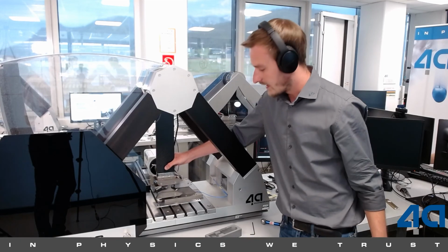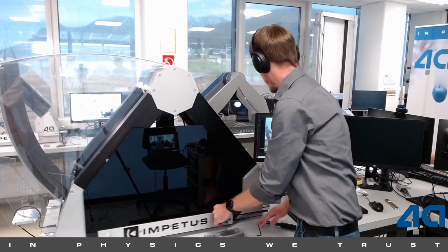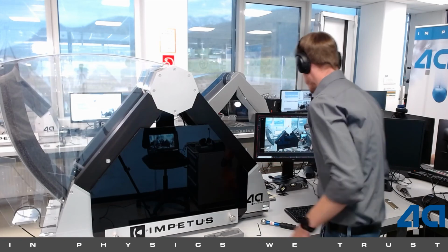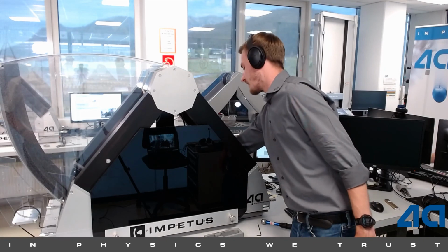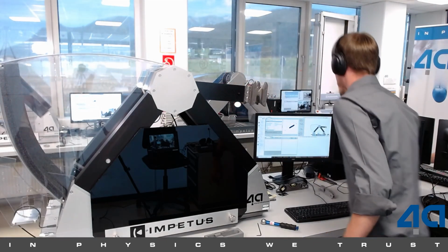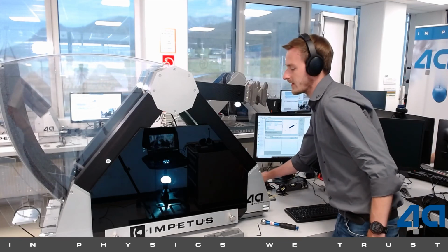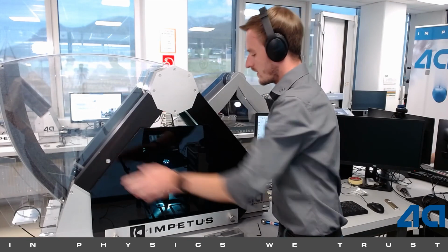We bring the pendulum arm in contact with the test piece. We have to close the window. Here we have a black window because of the bright light we are using for the DIC, as you can see here. I go to contact angle, raise the pendulum arm up, and perform a test at 3 meters per second. I go to start, activate the lights on a low level, and press the green button.